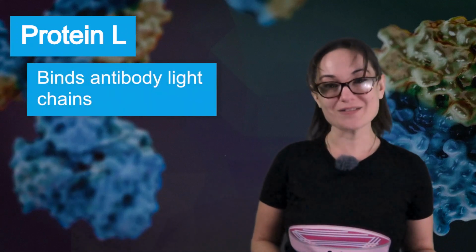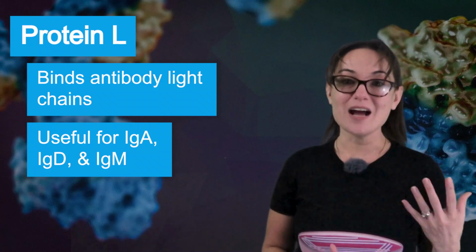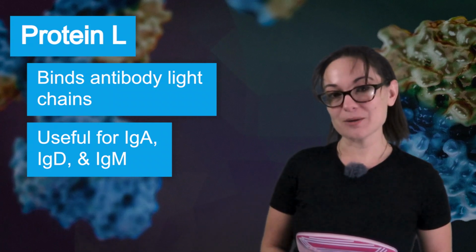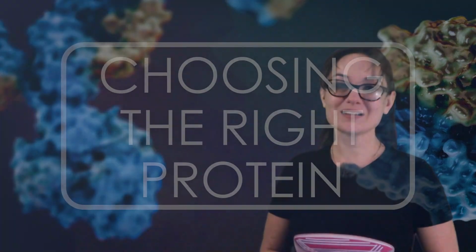And then we have protein L. Unlike protein A and G, protein L binds to the light chains of antibodies, not the heavy chains. This makes it ideal for working with IgA, IgD, and IgM classes in human, mouse, or rat samples. But it won't work for every antibody type, so you'll want to look at the compatibility overall before using this one.